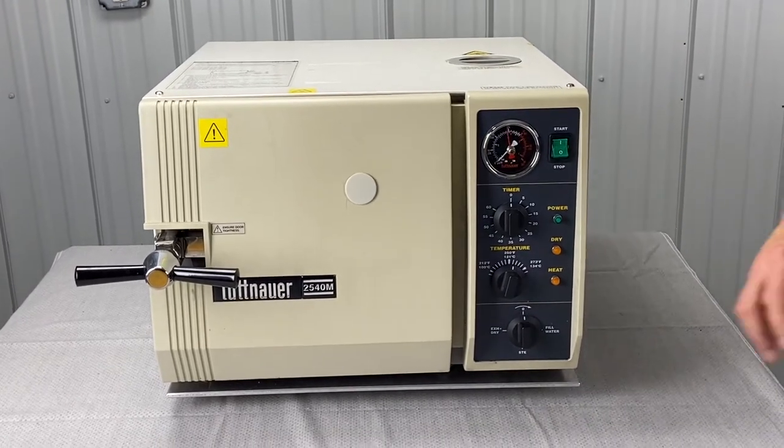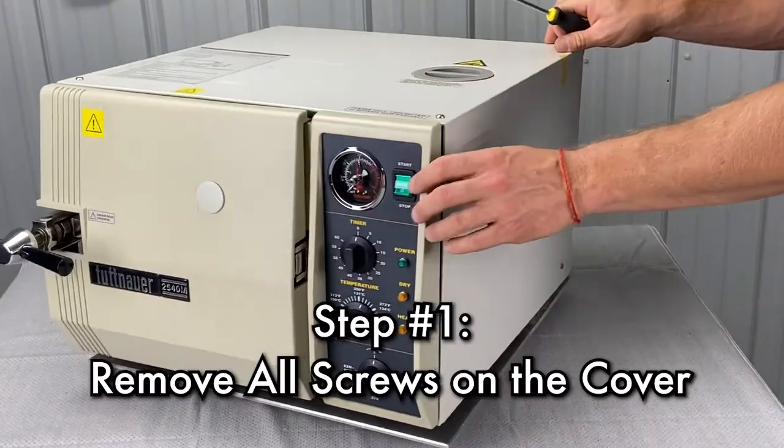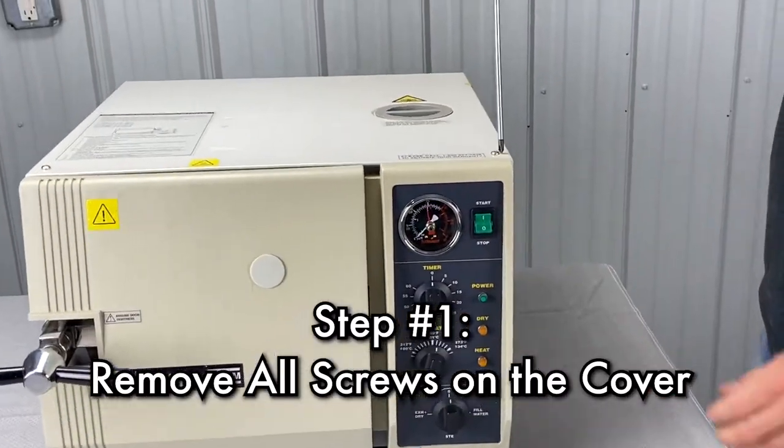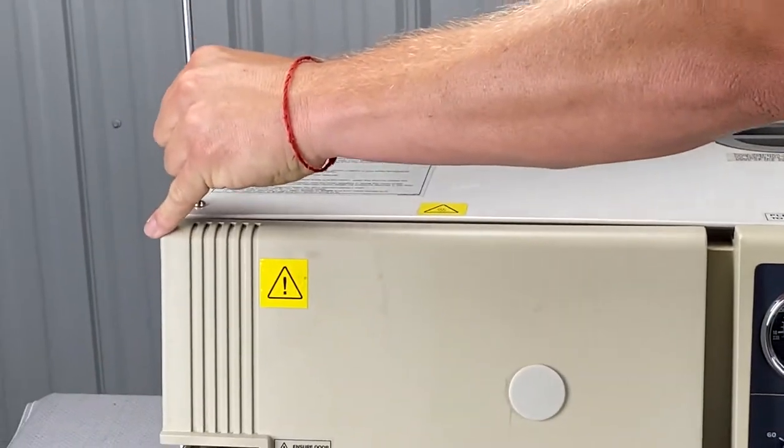You're going to need a Phillips screwdriver. Basically, we're just going to start unscrewing screws. You've got two on the top.